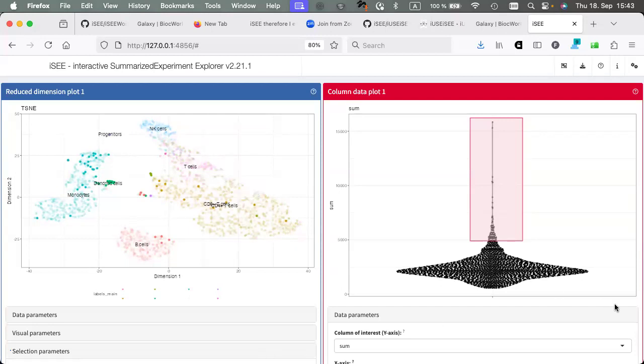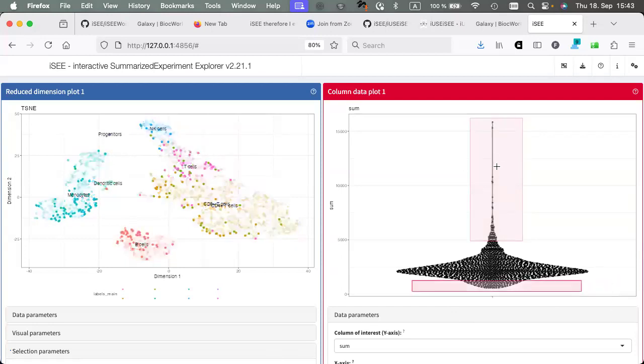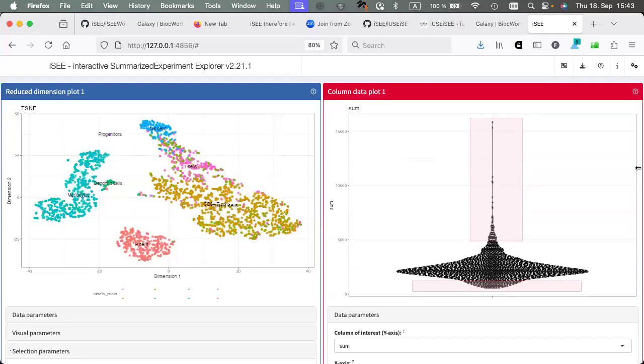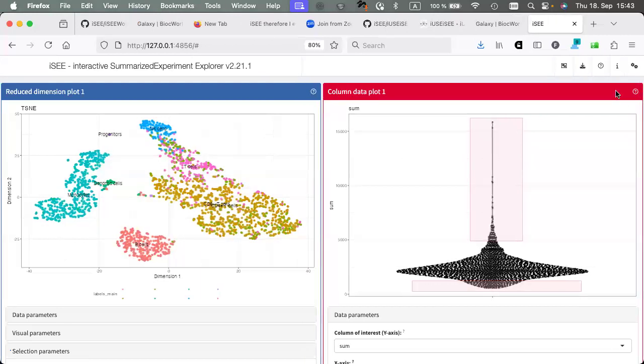It's not that touchscreen, but you can do whatever you want. Like I didn't take any snapshot of my any feed. How do I get rid of the older selection? That's something that we still might need to investigate with the Shiny team, which still has no answer. The closest solution is moving a bit this or trying to re-render the whole plot, but don't put the blame on us for that. It's okay, but can we reset? Yes, like not have any selection. Yeah, you can.